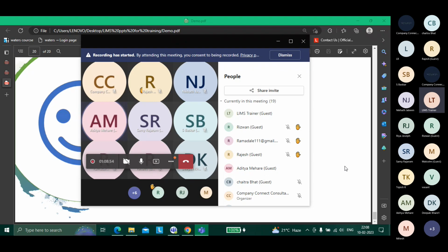Now you can ask me, sir, can we know how to create reports, Crystal Reports? I think the Crystal Reports manual is 1800 pages big. You can play with tables, create views, take data from the database, change the font. Maybe I'll show you some screenshots and you will understand how to run a report in one day. But can you learn to create Crystal Reports in one day? No, 100%. It's very difficult to understand.